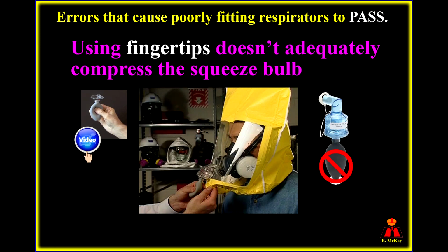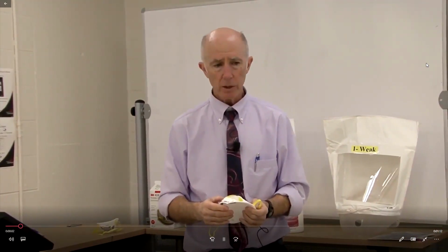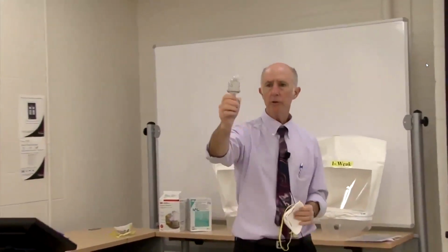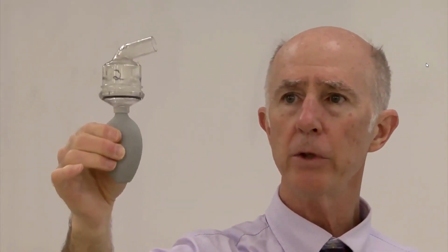So, using the fingertips doesn't adequately compress the squeeze bulb. Let's take a look at a video I've produced to show this in detail. And then lastly, when you squeeze the nebulizer, you need to use your entire hand. That may not have been obvious when you were watching me, but you squeeze with your fingers all the way into your hand. If I use my fingertips, if you watch a lot of training videos, you'll notice they're squeezing it like this. Very little, if anything, comes out if you do that.